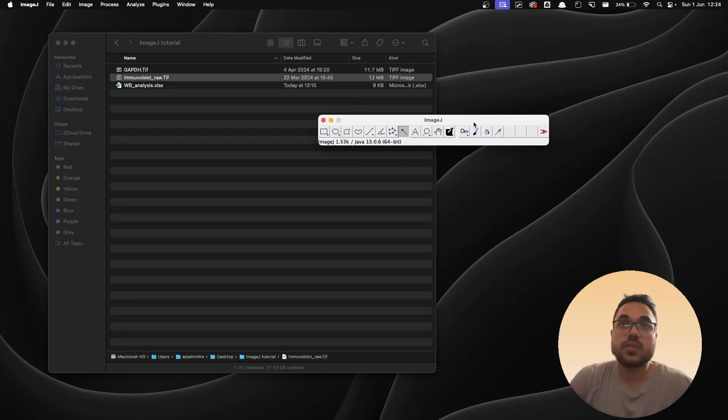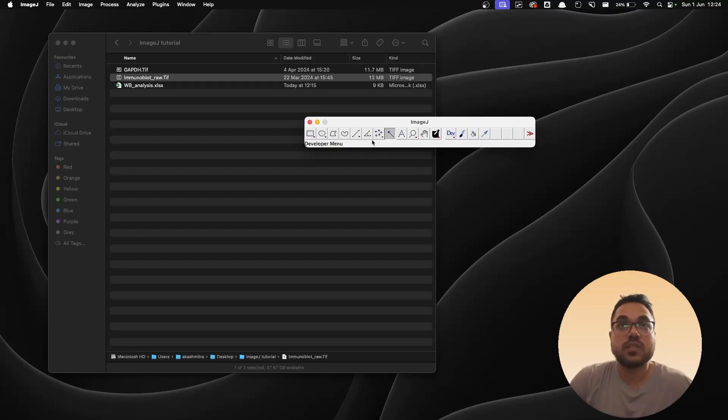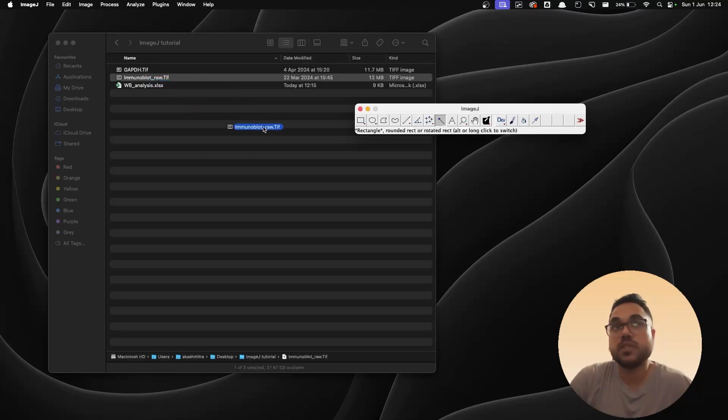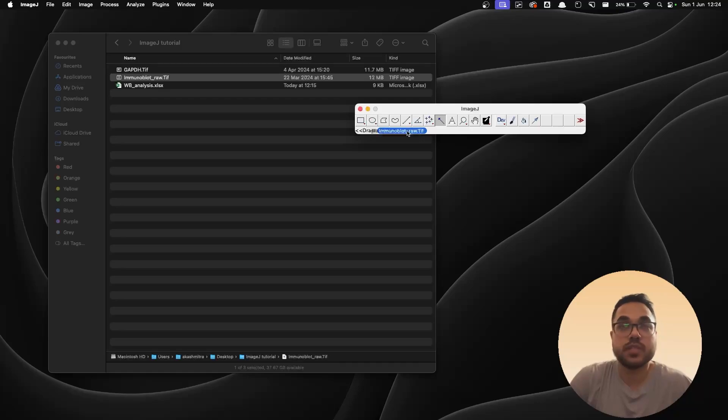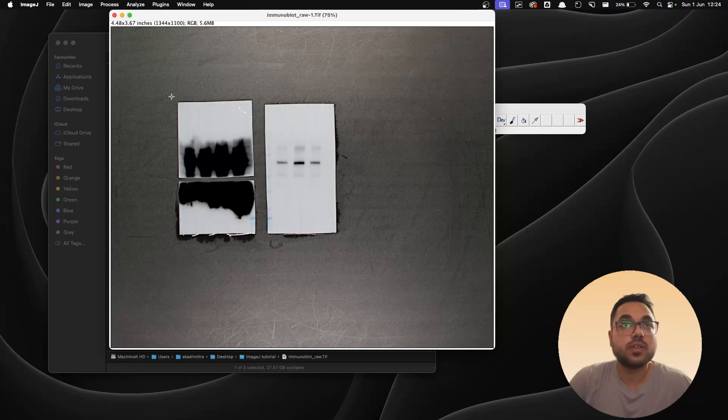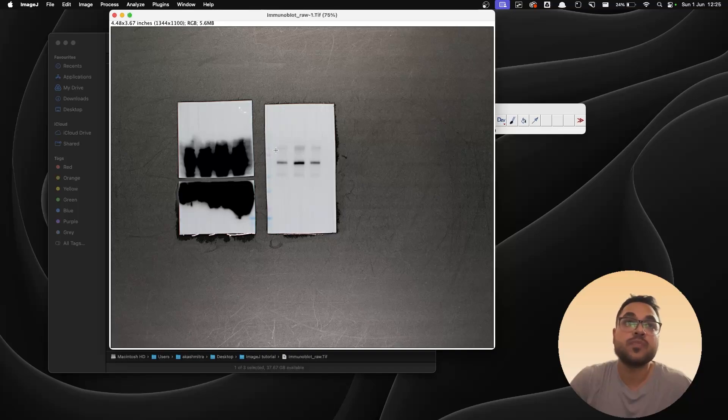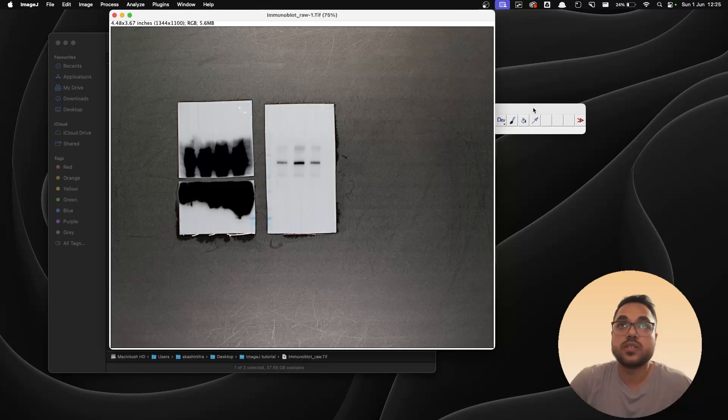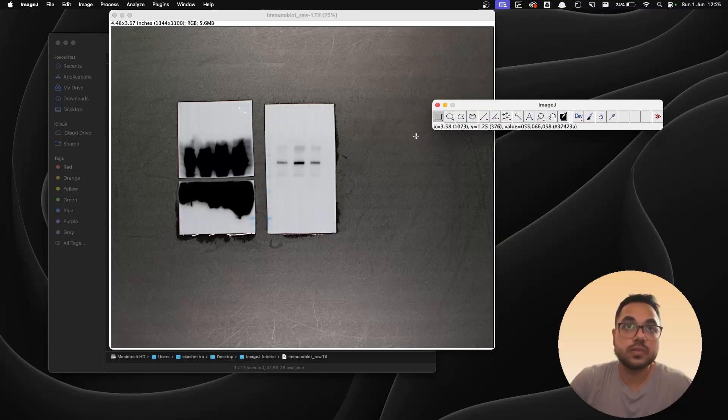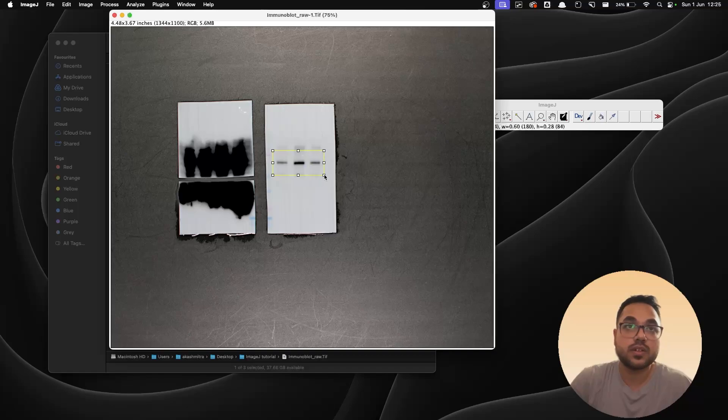We need ImageJ for this, so I've already launched ImageJ and there's the toolbar. I'm going to open up my blot inside ImageJ by dragging the blot onto the ImageJ toolbar. This opens this up. Now just ignore the left blot because it is very overexposed. We're gonna work with the right one. So in order to separate that out, I'm going to crop this. To do that, I'm going to take the rectangle tool and I'm going to create a selection around the lanes of the blots.